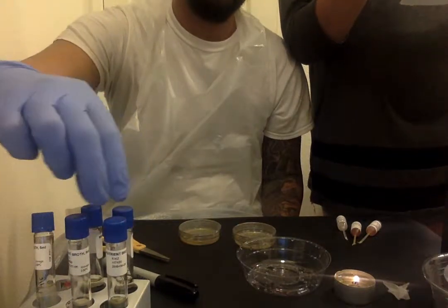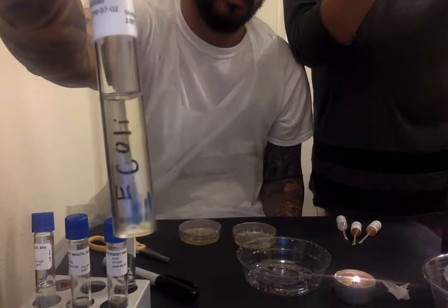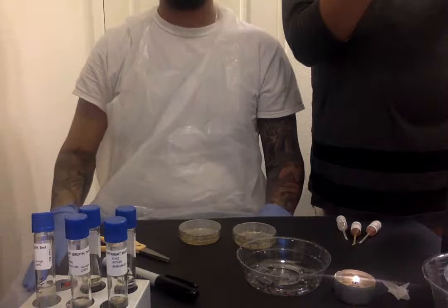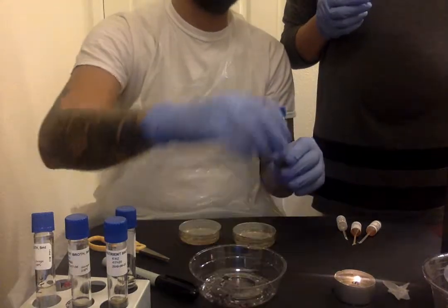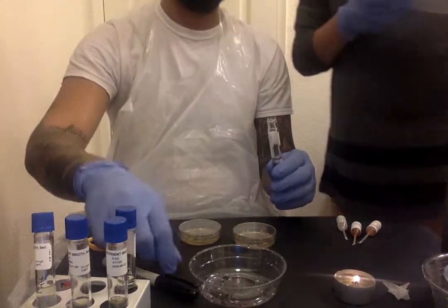So what we are going to do is remove the lid of the E. coli. Get the E. coli one, open the lid, and then sterilize it over the pen.